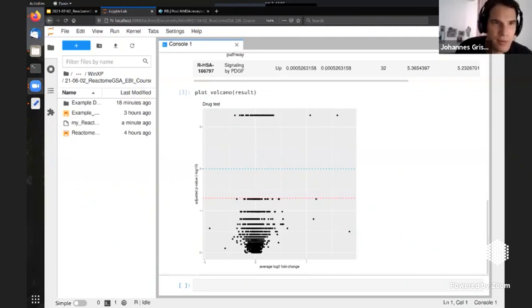Proteomics data must be raw or normalized. Okay, the proteomics data. So raw proteomics data is an issue anyway, right? In proteomics, you generally measure on the peptide level, at least in MS-based proteomics. And when you do the protein inference, so you get from your peptide level data to the protein level, you should have done the normalization already. So proteomics should be normalized on the PSM level. For those in proteomics, they will know what it means. So you generally should send us normalized data.